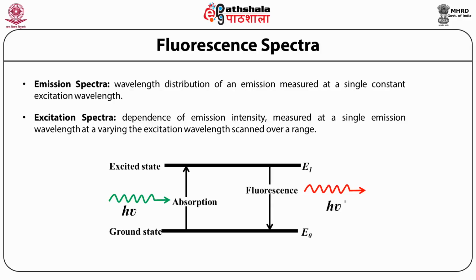The recorded emission spectra represent the photon emission rate or power emitted at each wavelength over a wavelength interval determined by the slit widths and dispersion of the emission monochromator. The emission spectra recorded using different instruments can be different because of the wavelength dependent sensitivity of the instruments.